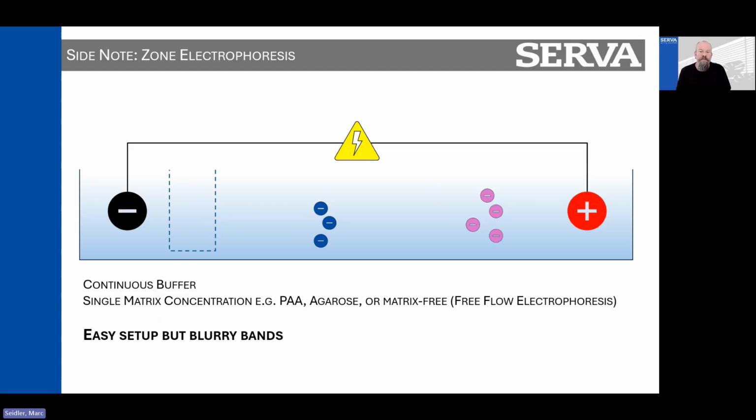So researchers of the world wanted to focus those bands to one line to have a higher resolution later when looking at the separation itself.